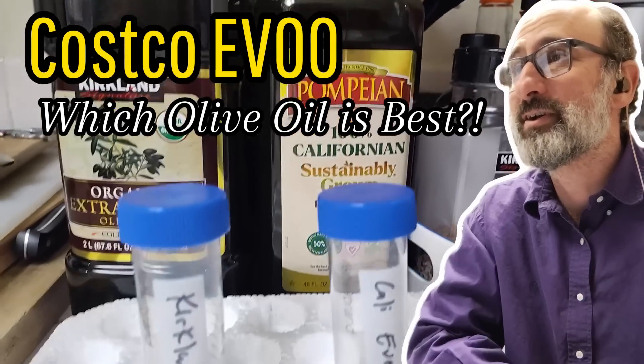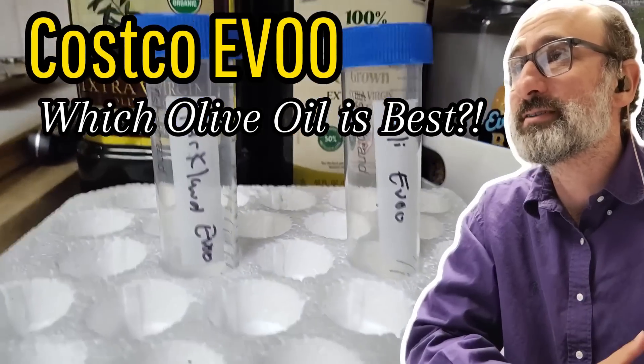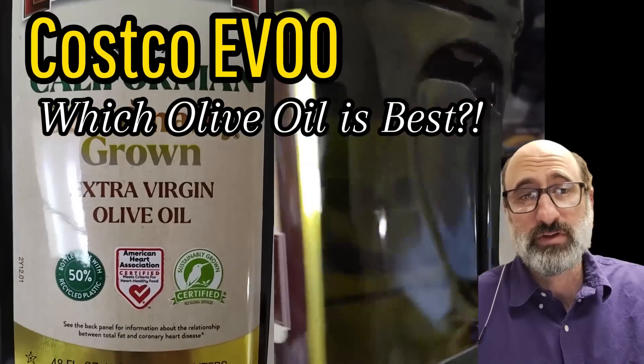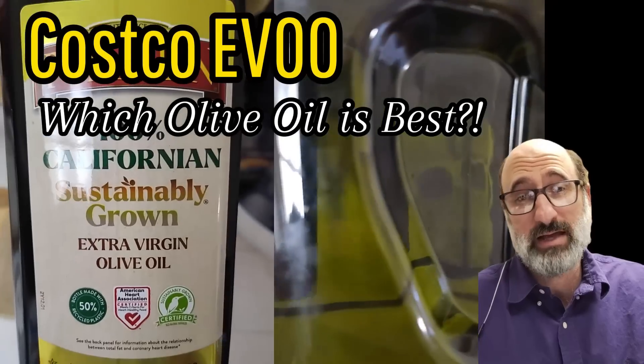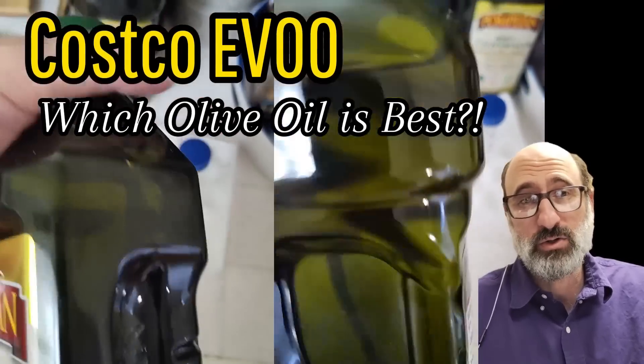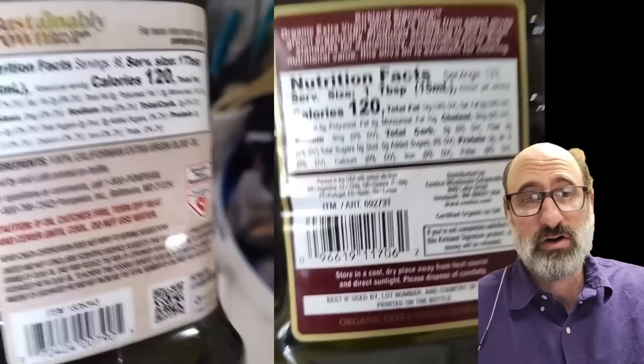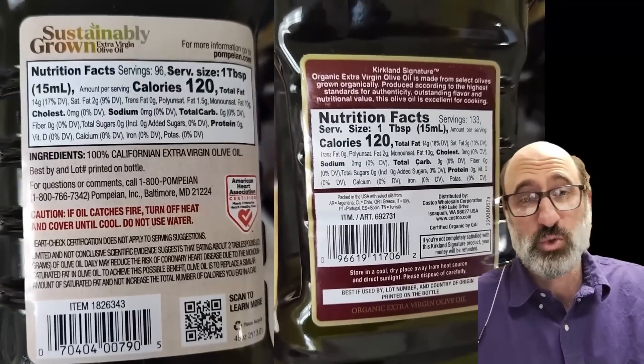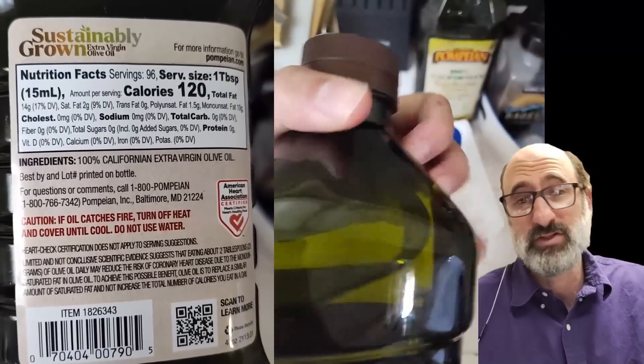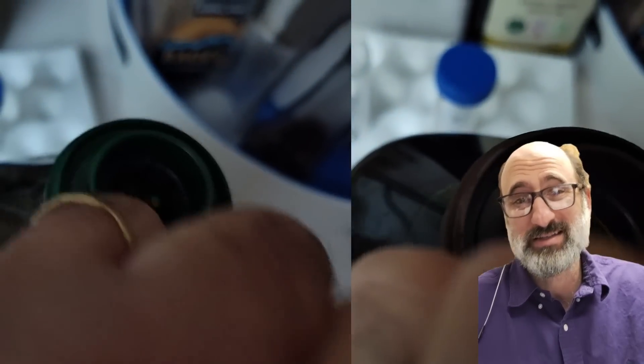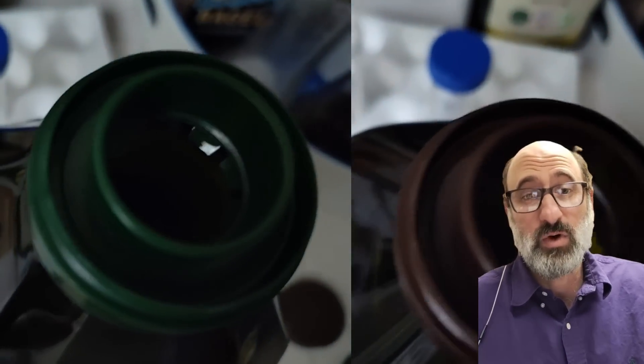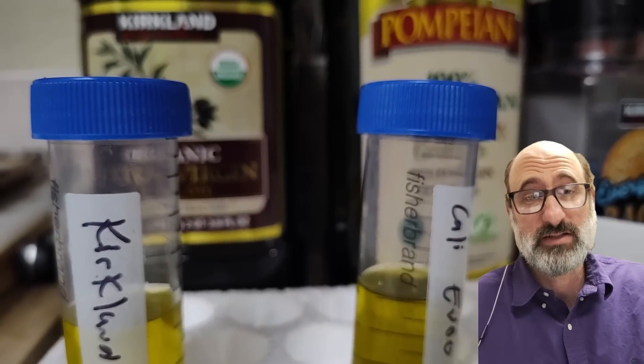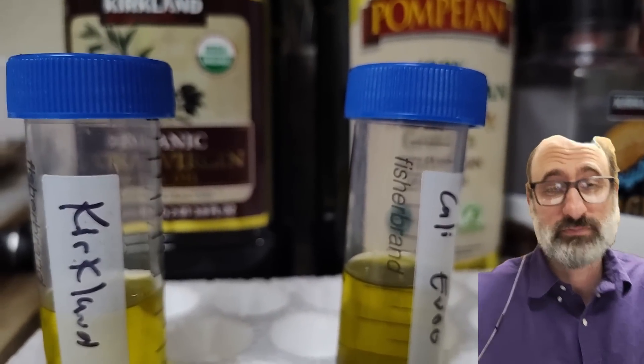We got the Kirkland olive oils. Which one of these extra virgin olive oils is the best? I'm going to compare it to canola oil and to other olive oils, but there's no way for me to know for sure if it's genuine. But I can use some of the data to make a good guess. So let's go ahead and see what we find when we analyze these two olive oils.